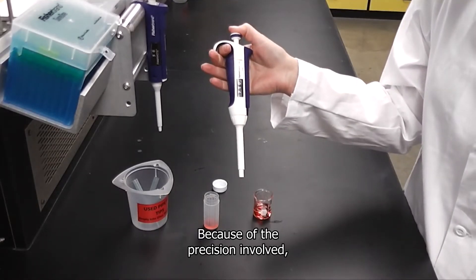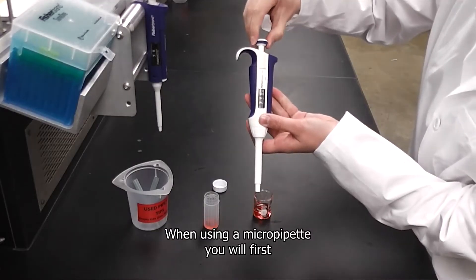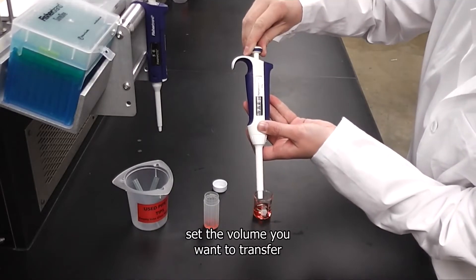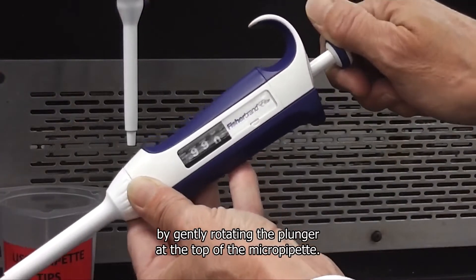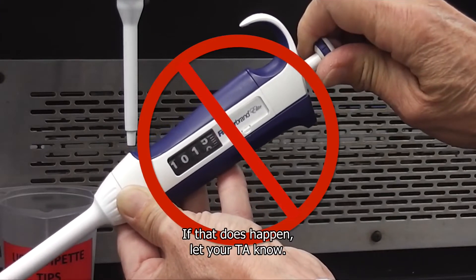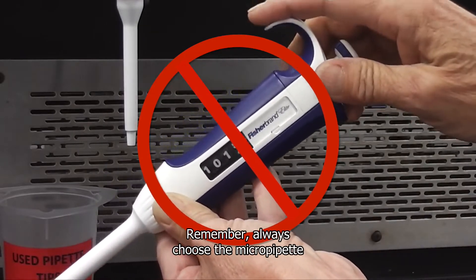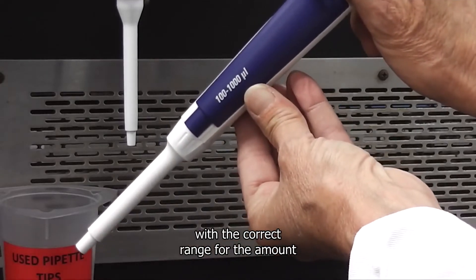Because of the precision involved, your technique is very important. When using a micropipet you will first set the volume you want to transfer by gently rotating the plunger at the top of the micropipet. Stay within the range of the micropipet or the numbers will jam. If that does happen, let your TA know. Always choose the micropipet with the correct range for the amount you want to transfer.